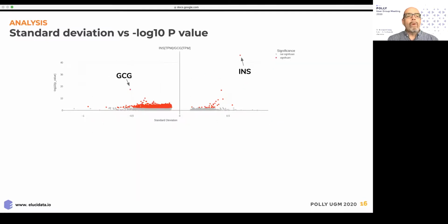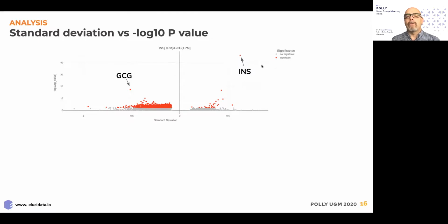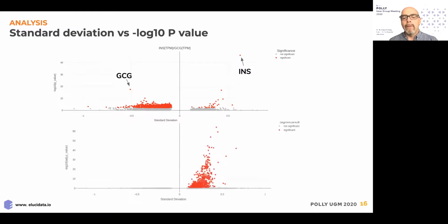So now when we look at the correlation of genes across these samples with our new ratio, we see, not unsurprisingly, that insulin is highly selected for, and glucagon is highly selected against. So our algorithm's doing what it's supposed to do. But now we've shifted a lot of the positive hits to the left, as they actually seem to be localizing with glucagon and perhaps other genes within the islet. And so we're filtering down what we're looking at compared to what we had seen before.